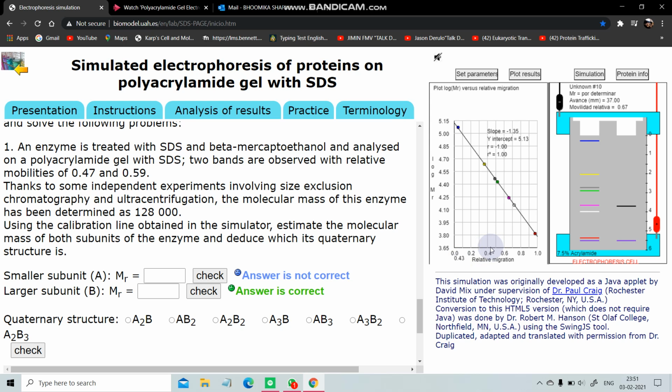Let's see. For 0.47, we are getting the value for the largest subunit as 30,884. All right, let's check. The answer is not correct, so I don't know what's wrong, but I just tried it with 30,000 and it was actually correct. So all right, no problem. Now I have to calculate it for 0.59. So I will plot for 0.59.